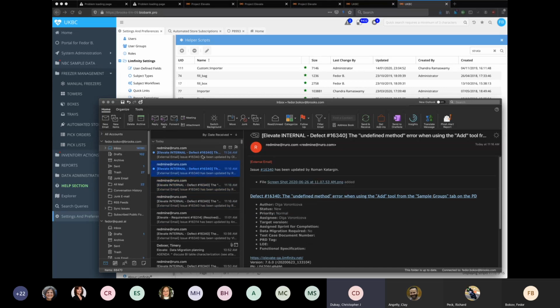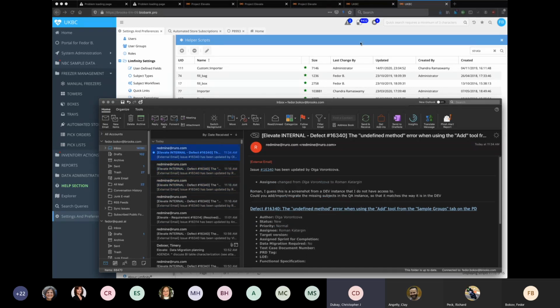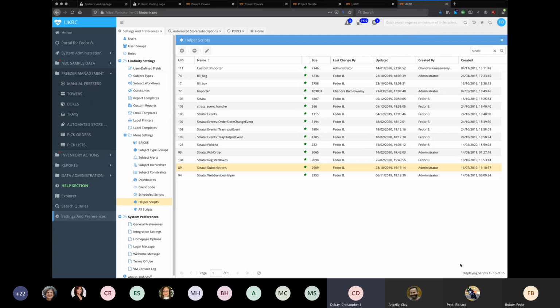It just seemed to me that the store already has a sample management system inside of it. And it's almost like one sample management system talking to another. So I was just thinking of making it the same sample management system. Okay, yeah, that makes sense in principle for sure. Strata is an existing system to manage the samples within the scope of that particular store, whereas Limfinity has a much broader scope and applicability.